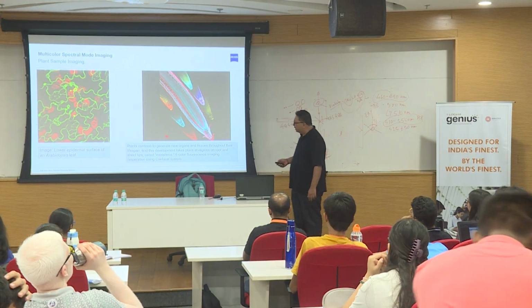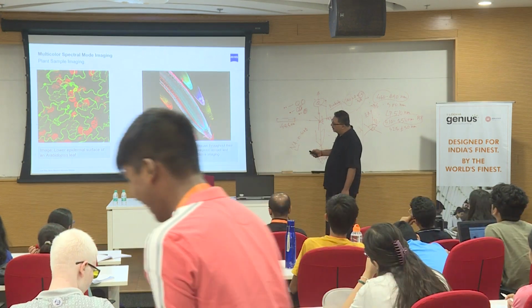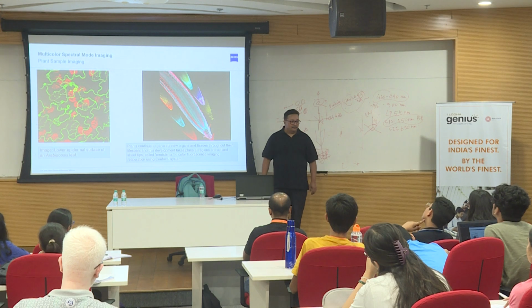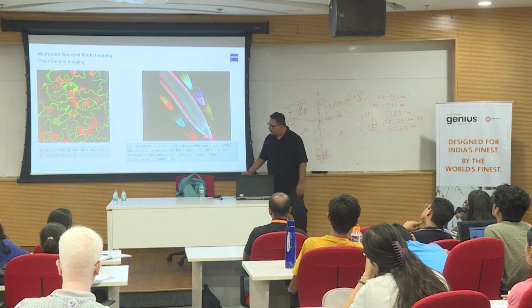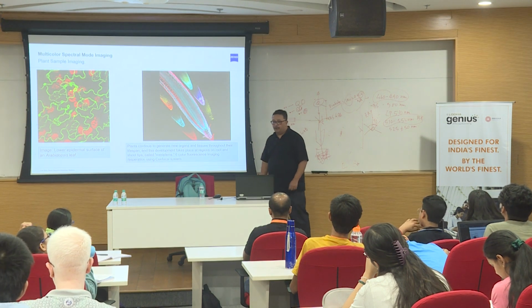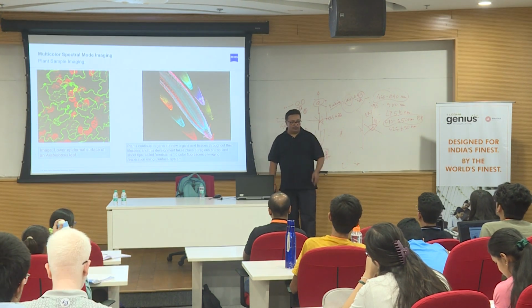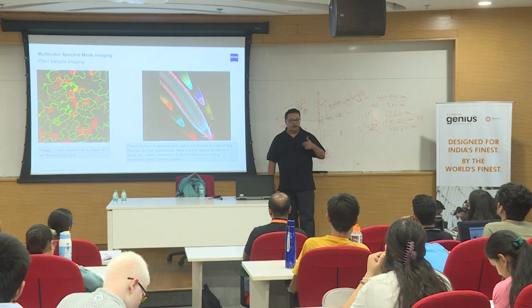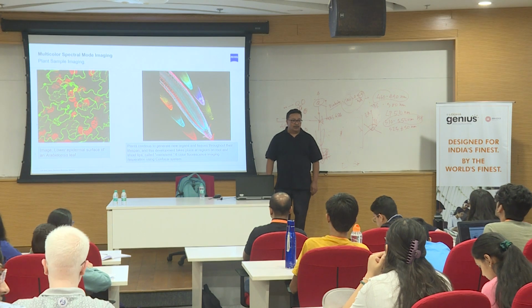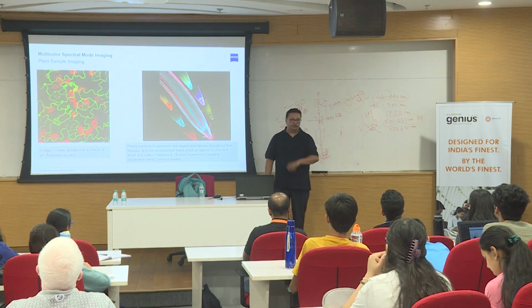You see over here, how many colors over here? Total. Can you know this? Total of 6 colors. And you see 6 fluorophores on a single sample. So you can see multi-channel, multi-color fluorescence imaging. Forget about one single fluorophore. You can talk about multi-color, multi-fluorescence imaging at any point of time. And bleed-through free images that you can generate with a confocal with quantification of your data.